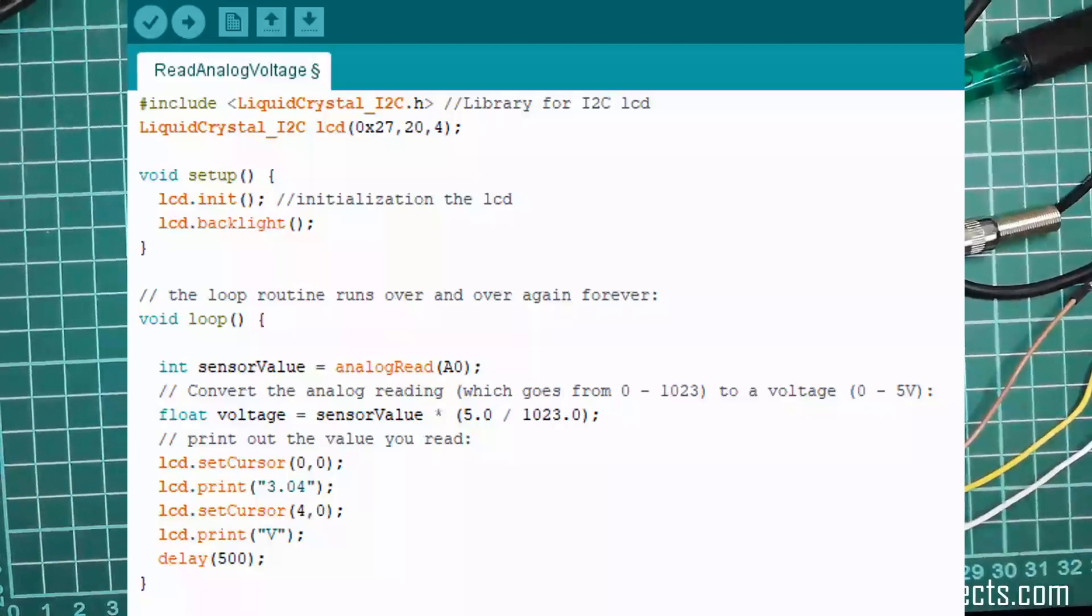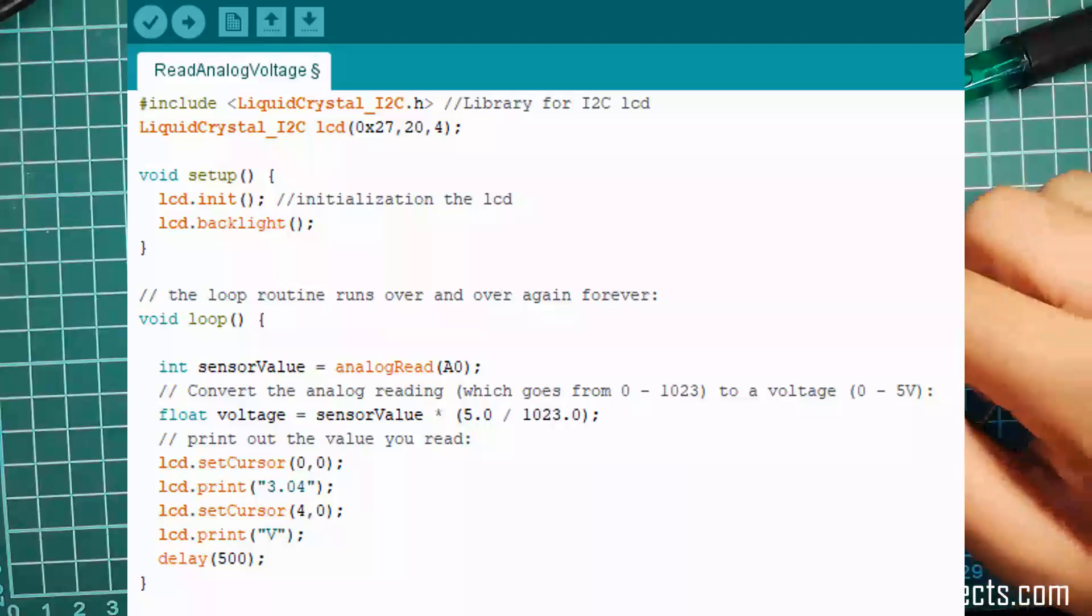Step 2: Upload the calibration program to your Arduino board. You can download the software code from the link given in description section. This program is only for voltage reading. It is not compulsory to use this program. You can also measure the output voltage at point P0 of this module using a multimeter.